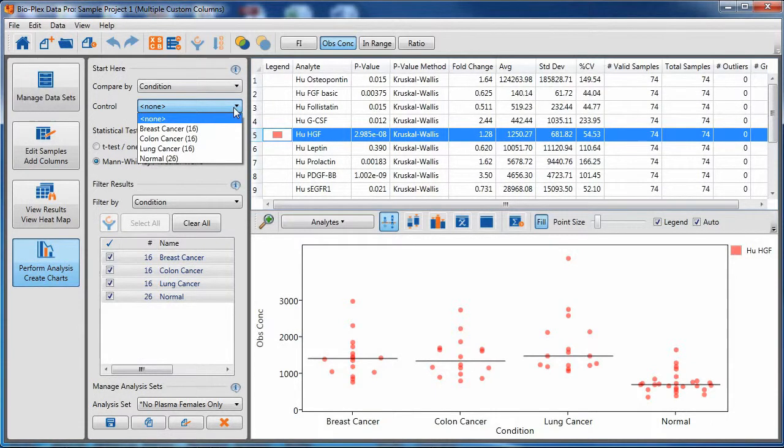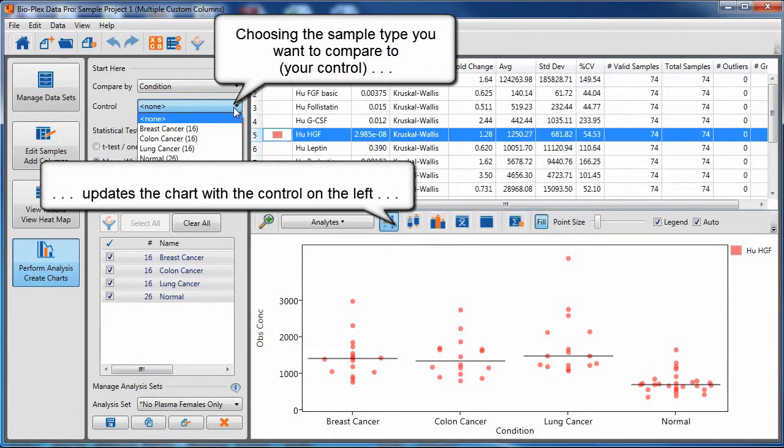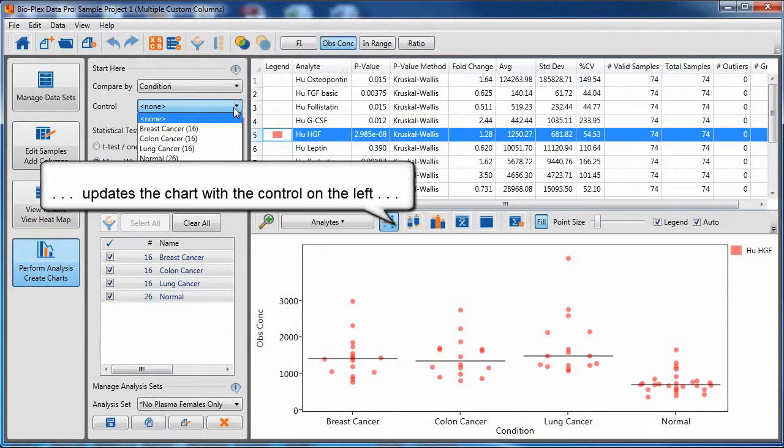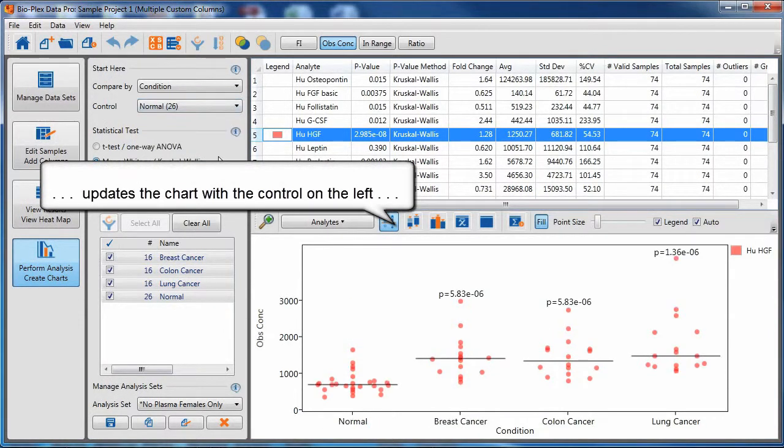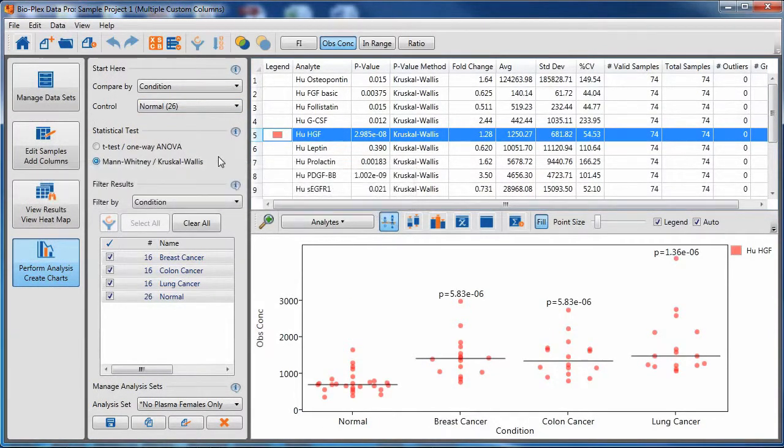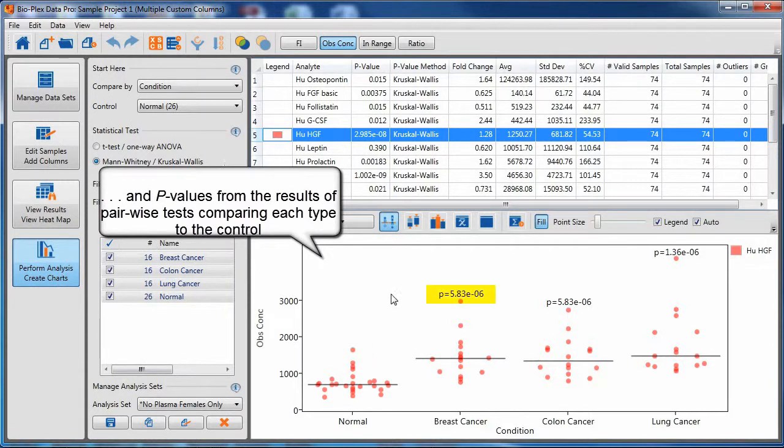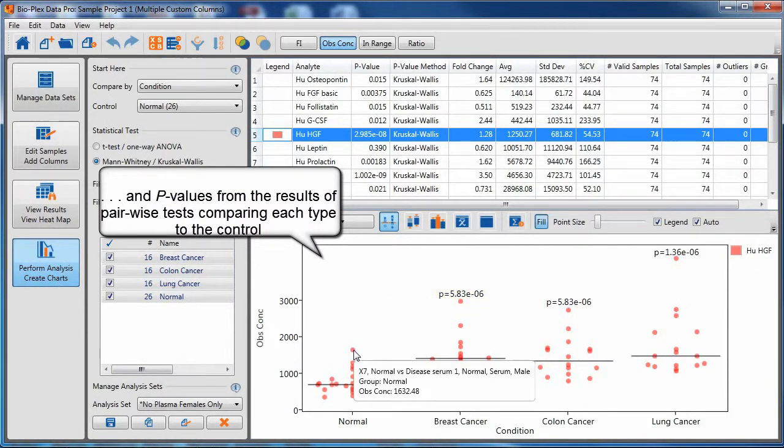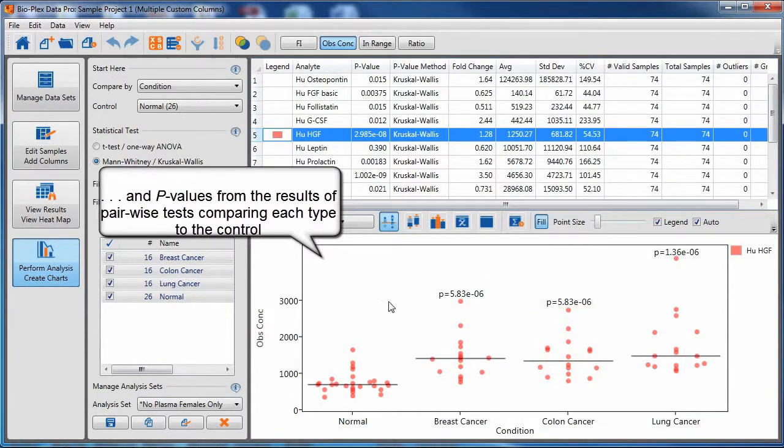If I choose a control or a sample which I want to compare all my experimental states to, the chart will update with the control on the left. And a statistical test doing a pairwise comparison between the normal or the control and the experimental states will be calculated and displayed on the graph.